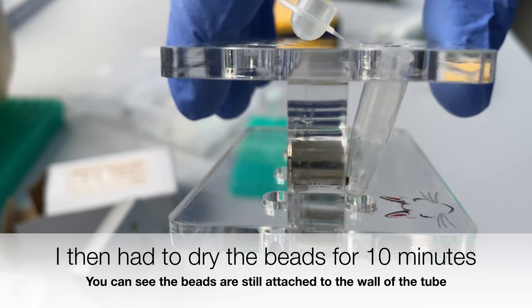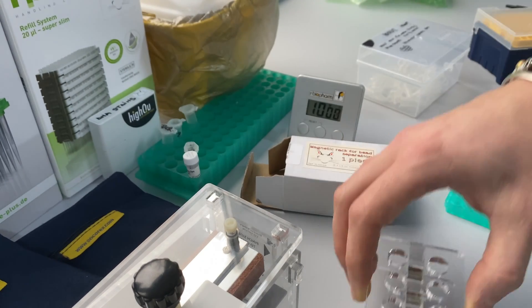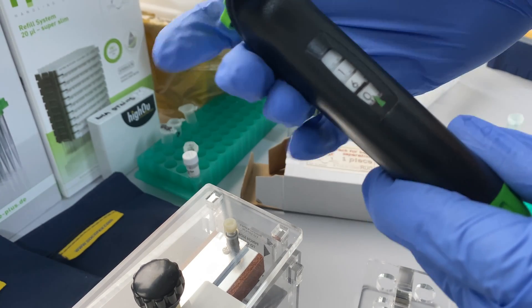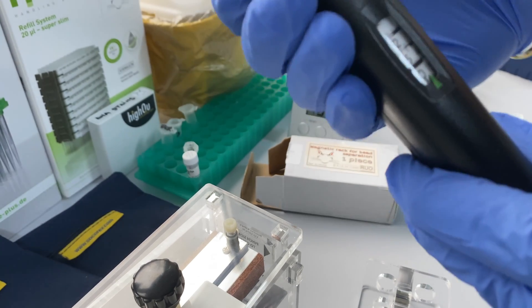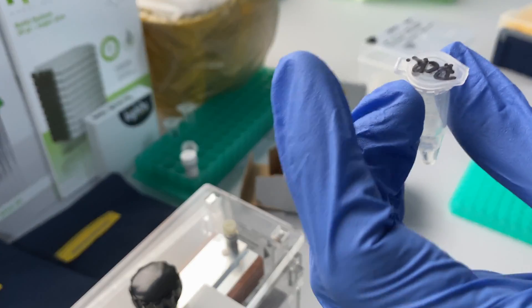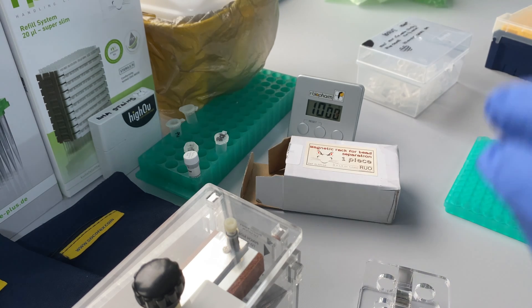After carefully removing the liquid, I had to dry the beads for about 10 minutes. After the drying step was over, I added 25 microliters of water to the mix, then mixed it and incubated for 2 minutes to elute the DNA from the beads.